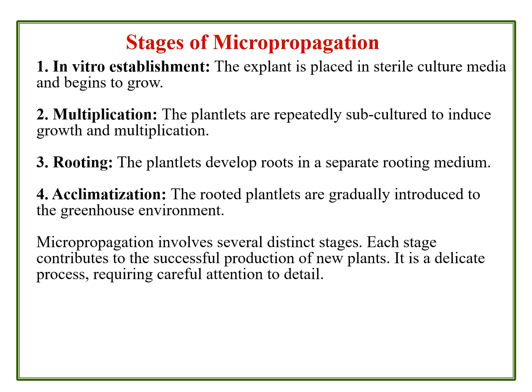The plantlets are regenerated by subculturing the small aggregates of the callus, and so the growth and multiplication of lateral buds or multiple shoots will be raised at the multiplication stage.